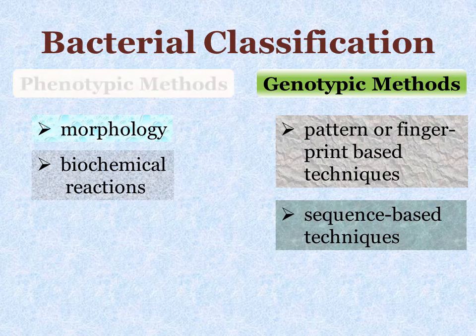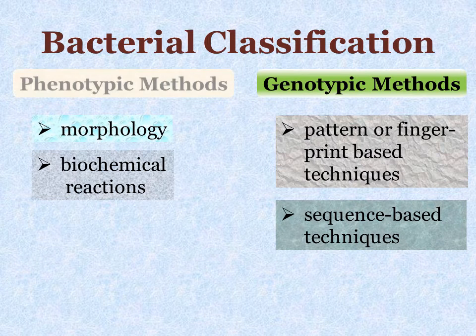Phenotypic techniques, however, can yield more direct functional information that reveals what metabolic activities are taking place to aid the survival, growth, and development of the organism. This may involve, for example, a microbe's adaptive ability to grow on a certain substrate or the degree to which it is resistant to a cohort of antibiotics. Genotypic and phenotypic approaches are complementary and use different techniques.